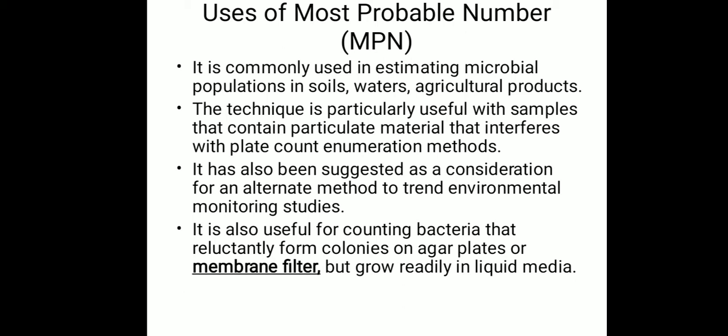Then also it is useful for counting bacteria that are reluctant to form colonies on agar plates or membrane filters but grow readily in liquid media. So these are the few uses we have for the MPN.